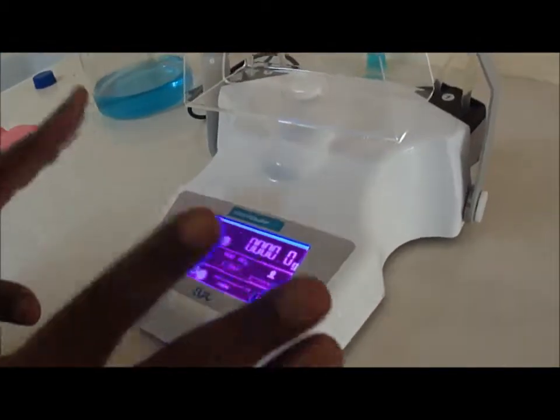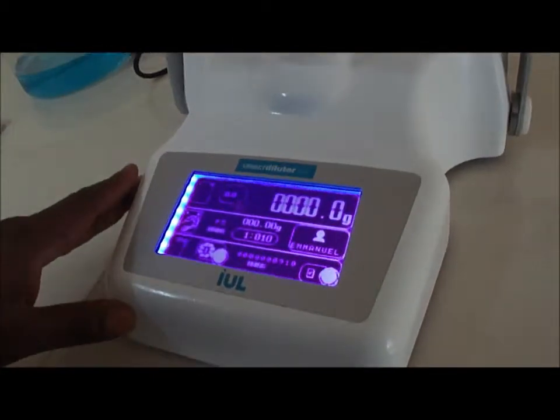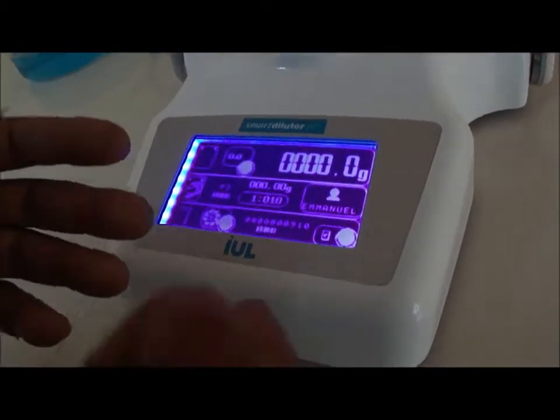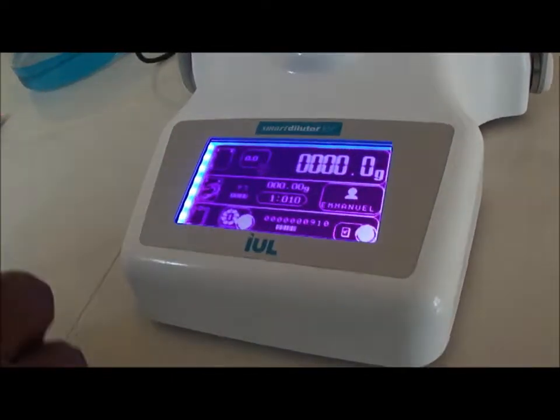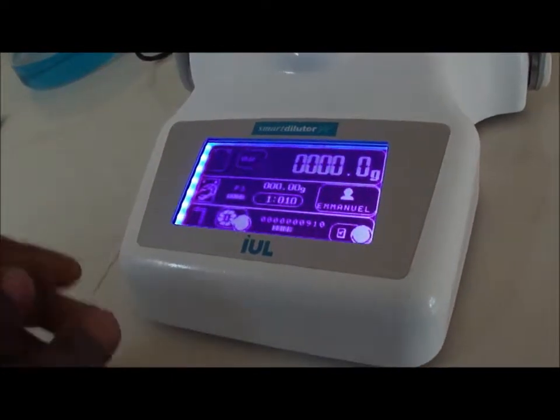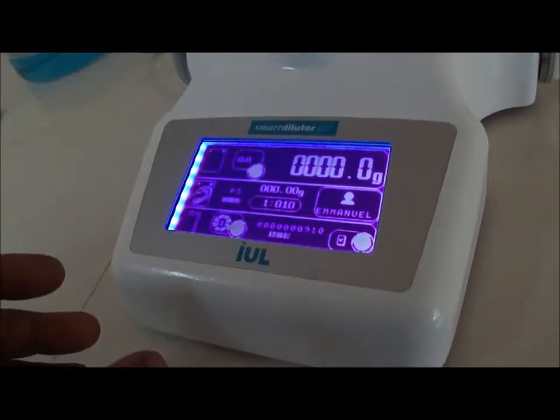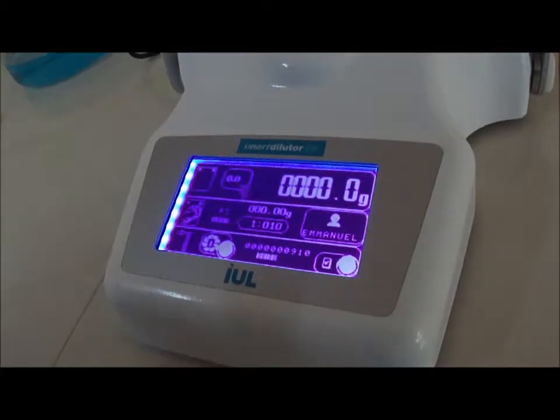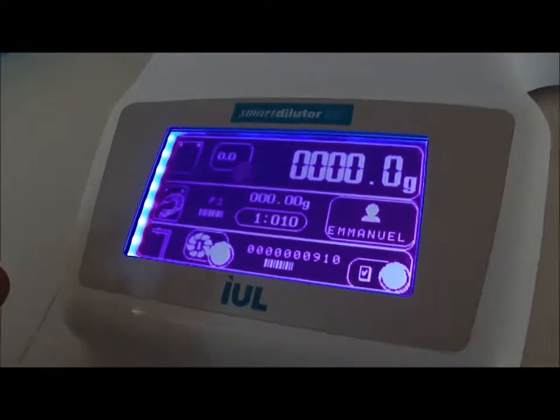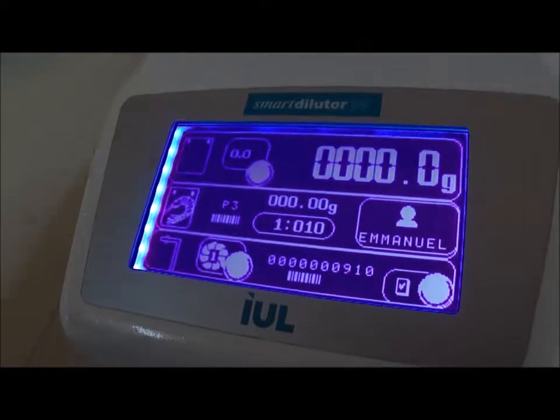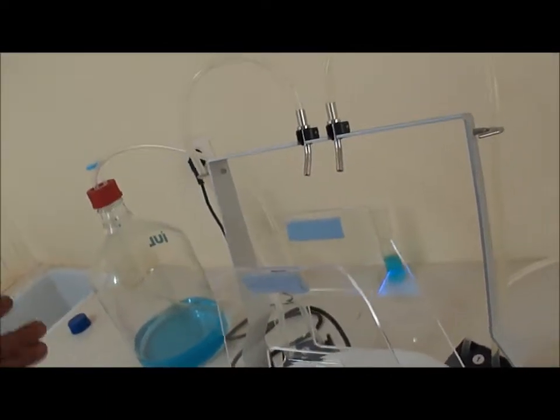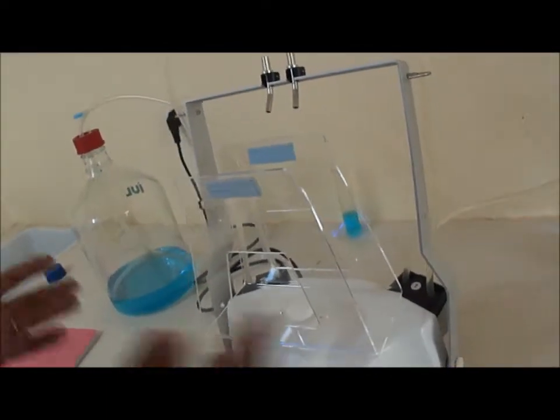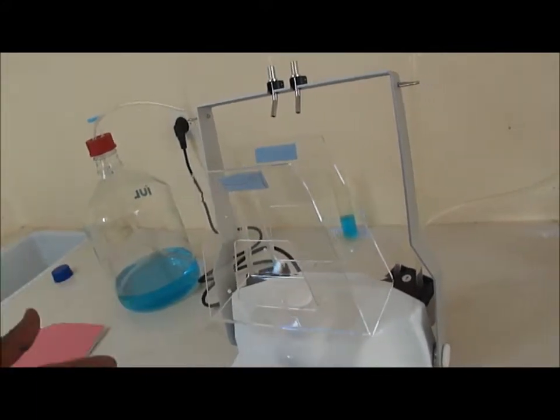One should know that there are two functions for this dilutor. One is the dilution, so for that you need a dilution factor, and the other one is dispensing. In the case of dispensing, you have a sample, you have targeted the final weight when you mix your sample with a diluent. That is dispensing. So that's why also you have two bottles, so you can use one for each of the functions according to the type of work you want.